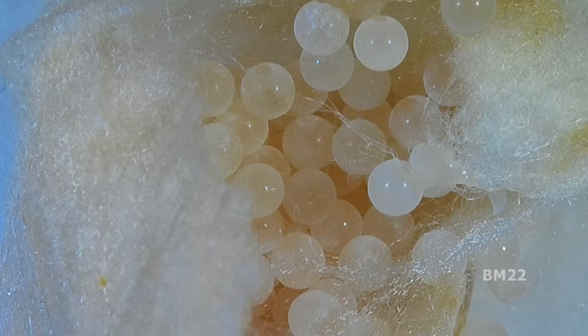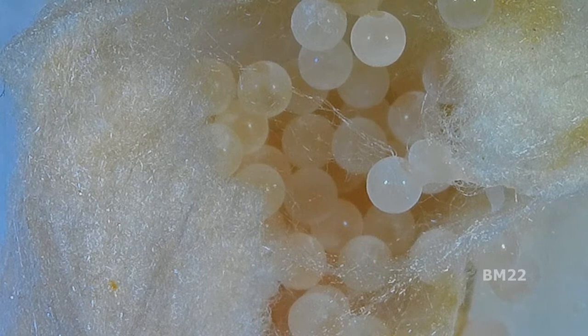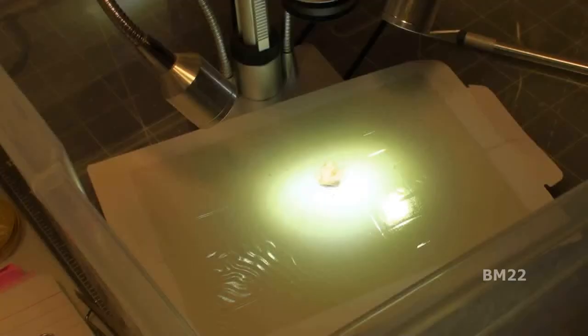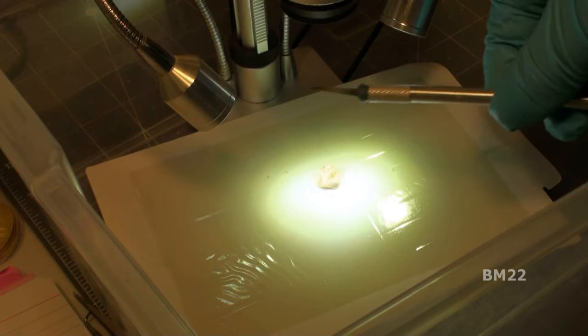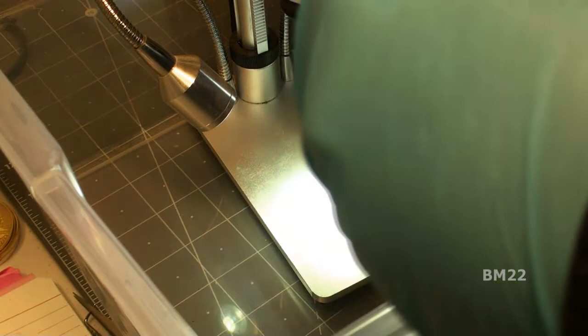I'm having a hard time getting the egg sack centered under the microscope. I centered it on the sticky board but having trouble getting it in frame. Opening it up now — wow, that's kind of interesting. All I see is black widow spider eggs. I'm surprised we didn't see spider babies come out of here, because we have multiple times before — spider babies just boiling right out, scariest thing you ever saw. I guess we can say disaster averted.